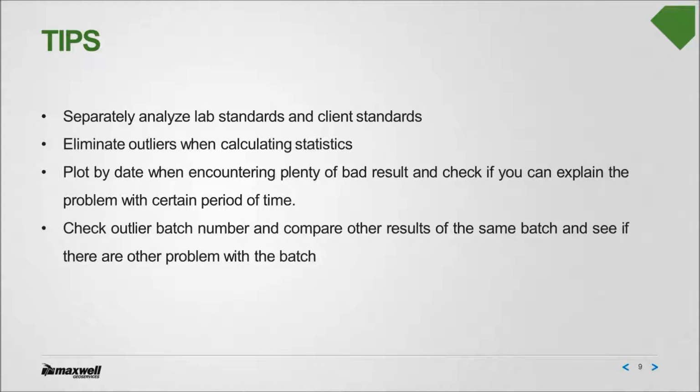Tips. When we are using QAQCR, it's a good practice to separate lab standards from client standards. Client standards are very specific to our assaying samples. If a client is doing iron ore mining, then you would not use representative standards for gold mining companies. But the lab standards cannot be that representative, so it's a good thing to analyze the lab standards and the client standards separately.